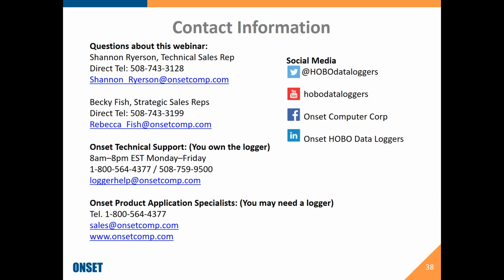So the long answer to your question is that the data shuttle isn't wireless in that it's extracting data from the logger wirelessly, but you can use it wirelessly in terms of not having to have the shuttle connected to a computer, whereas the base station does require you to have a connection to the computer during configuration and during data download. The base station is also not waterproof, so you would have to dry off the loggers before you connect them and download the data.